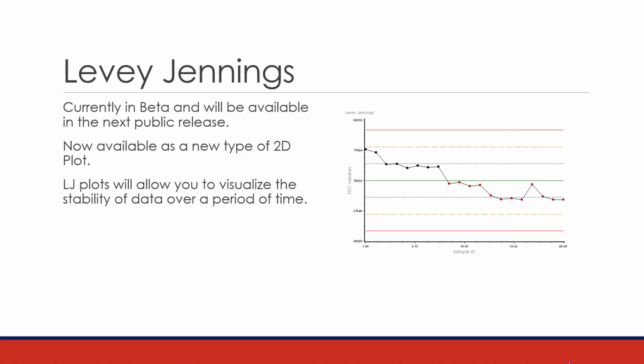Okay, so Levey Jennings, we're certainly excited about that. One thing to realize is that a lot of the features that you'll see today that are either available in our latest release of FCS Express or in an upcoming release are features that were included due to customer feedback. Okay, so if anyone has any features or any ideas, any requests that they may want to see in FCS Express, please let us know. It may take us a while to implement certain things, but if it's doable, we will certainly implement it. If it makes sense to the software and makes everyone's life a little bit easier, we would certainly consider adding various features to the software, no doubt. And that's where features like Levey Jennings have come to play.